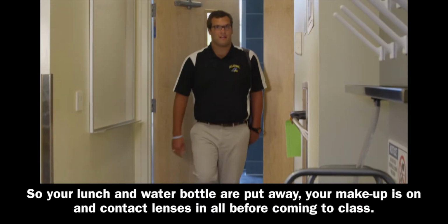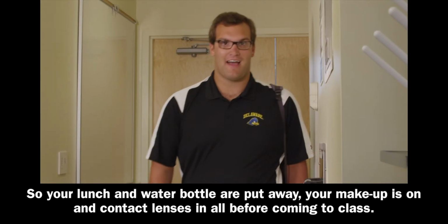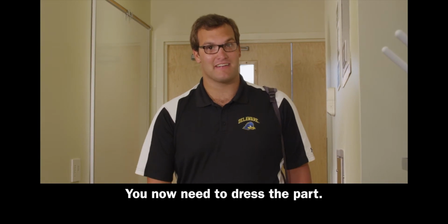So your lunch and water bottle are put away, your makeup is on and contact lenses in, all before coming to class. You're all set to start lab, right? Well, not exactly. You now need to dress the part.